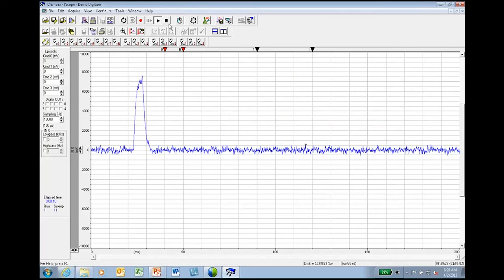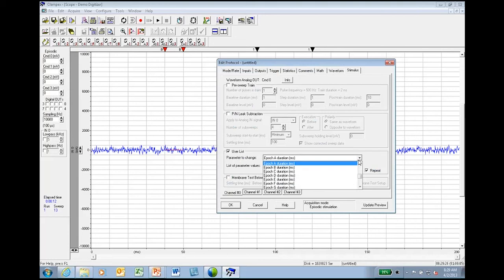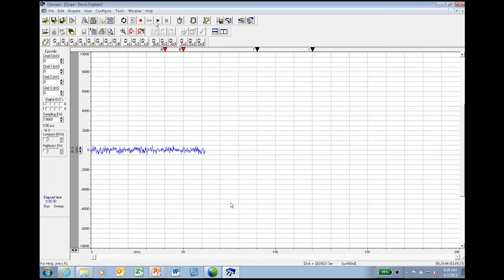Okay. Now I can also go back to here. I can change the voltage for the holding level. The holding level is at B, just like here, because before I gave 100 millivolt in here. Now you will see something like this: 10, 20, right? 90, right?